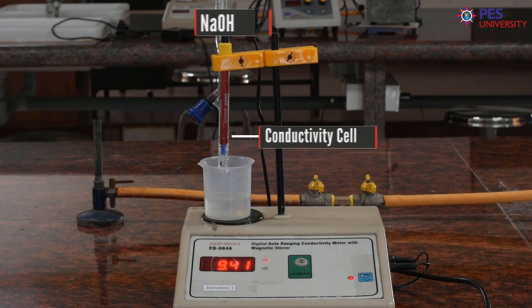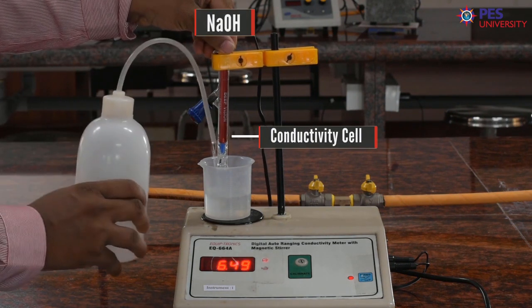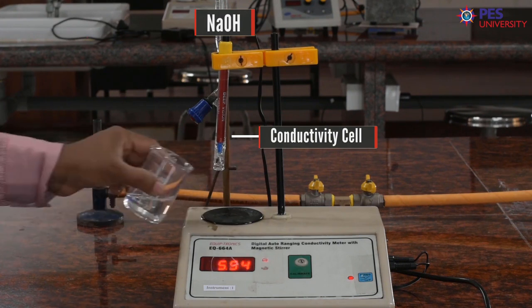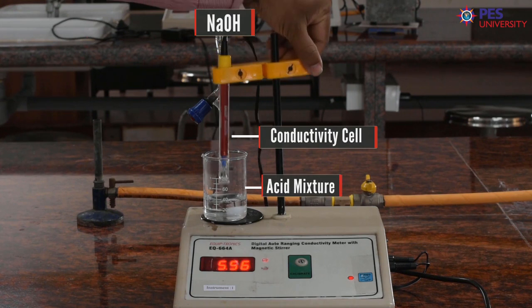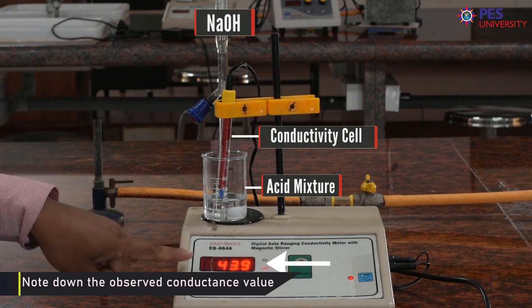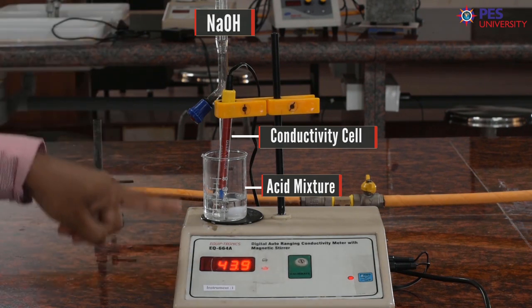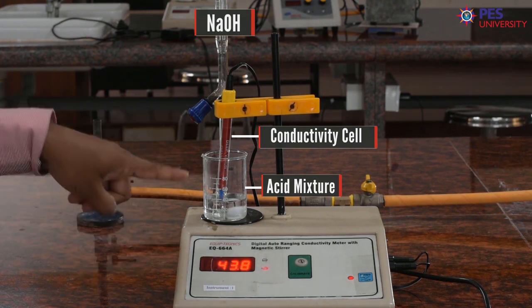First, rinse the conductivity cell with distilled water like this. After that, immerse this conductivity cell inside the acid mixture. Then note down the conductance value without adding NaOH solution. Initially conductance values will be high, that is because of the high concentration of H+ ions which is there in the solution.